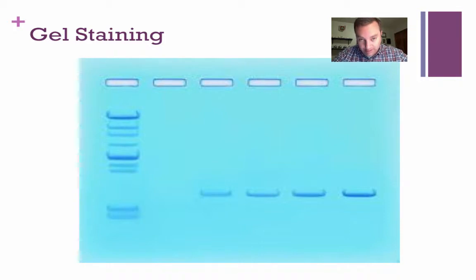This is an example of what was supposed to happen in our experiment. The very first lane was the zero cycle — we didn't make any copies of DNA; this was the control. Lane two would be the ten cycles — it's a little bit darker, so you have more DNA. The third lane is the 22-cycle run, with even more DNA. Finally, the last lane is the 30-cycle one, which has the maximum amount of DNA because it's gone through the full PCR.